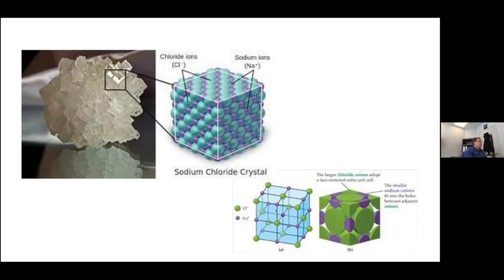And so down in the right, we can get a representation of the sodium chloride crystal. So the chloride in green and the sodium ions in purple. And you can see this is just a small section of the crystal, but no matter where you move inside the crystal, the atoms continue to have this sort of arrangement. So it's a repeating pattern of a spatial arrangement.